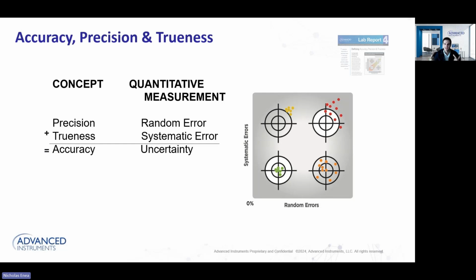So when we're looking at the ways of adjusting pipettes or adjusting liquid handling, and we're looking at workflow efficiency specifically, just know that these things are treated separately from one another. They have a role in every assay, but really, it's dependent on your workflow and application when you're judging whether you need to be true or precise, or both, as some of you said in the chat as well. So hopefully I didn't lose anyone by going through these 3 slides.